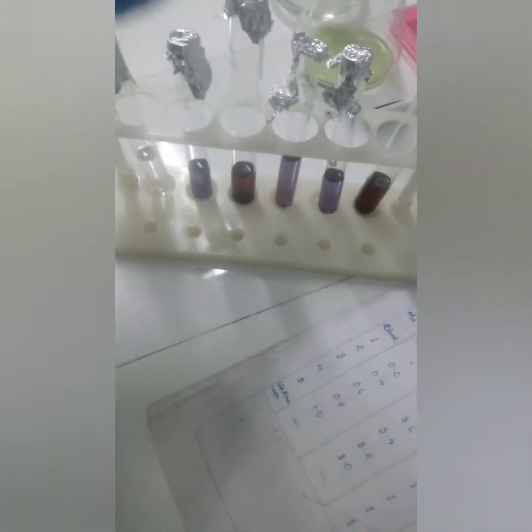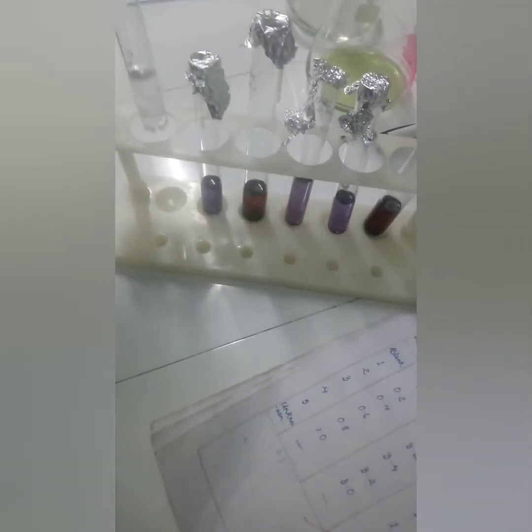So, sorry. You can see after taking out these test tubes from the hot water bath, the color changes to purple. At first you will see it is like this, like the blank only, but after the reaction occurs, because we have already added this Ninhydrin reagent, 1 ml to each test tube. As you can see, the blank does not change color. Why? Because here we have added only water, so there is no amino acid, so no reaction takes place.